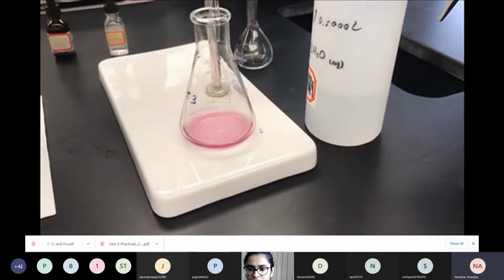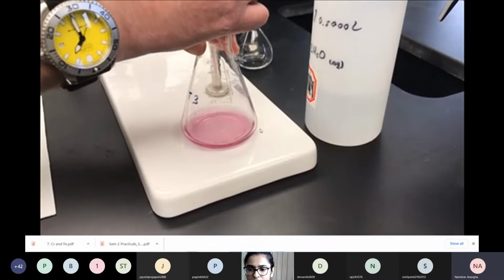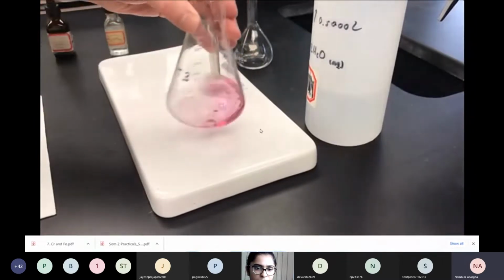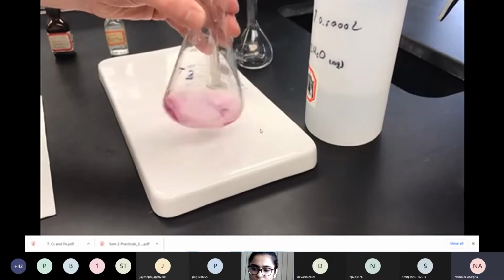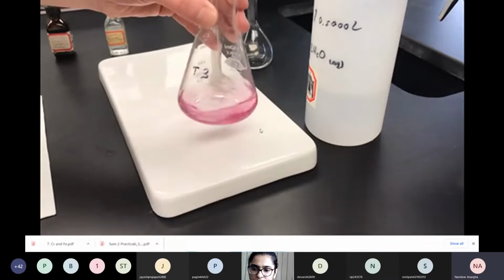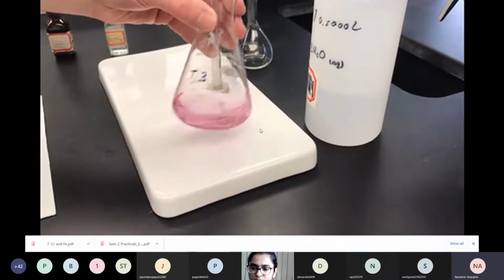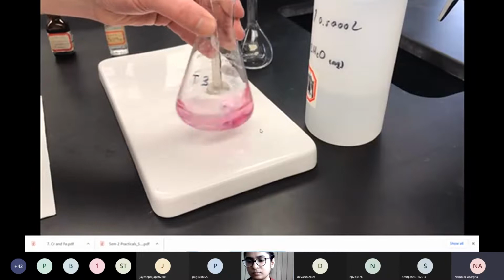So let's do that. So I'm going to go ahead and bring the burette just up a tad, and I'm going to go ahead and start adding the titrant fairly quickly. Now at this point, I just want to swirl, and I'm going to keep my eye on the burette to make sure I'm not putting more than about 15 milliliters of titrant in, because then we're going to slow the titration down after that and make sure we can sneak up on that endpoint.